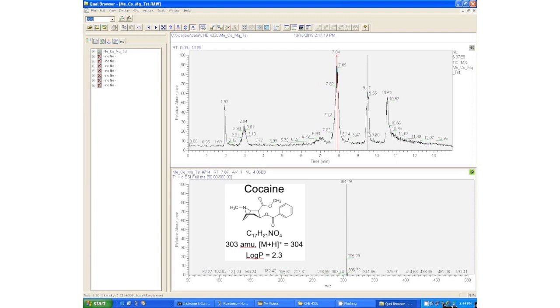I've put the log P there because you'll be able to see that these peaks in the LC eluted in the order that we would expect based on the log P. This is a C18 column with water with a little bit of formic acid as solvent A and acetonitrile with a little bit of formic acid as solvent B. So we expect the compounds to elute from least nonpolar to most nonpolar, or from lowest log P to highest log P, and that is the order that they eluted here.